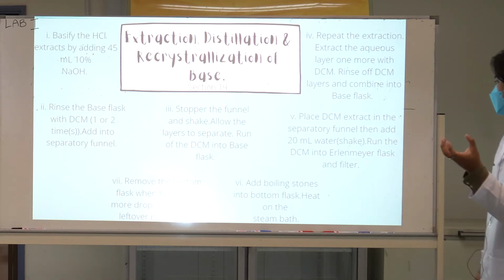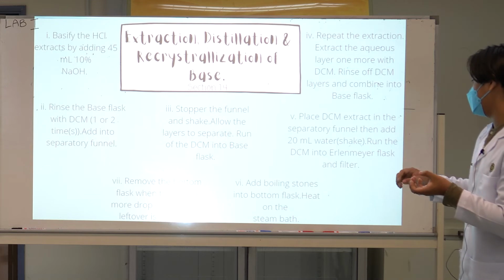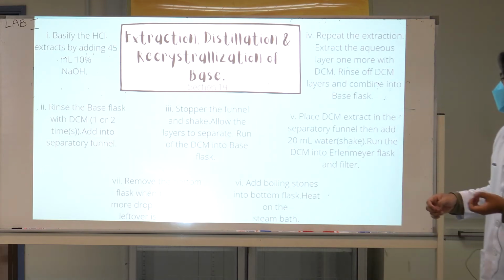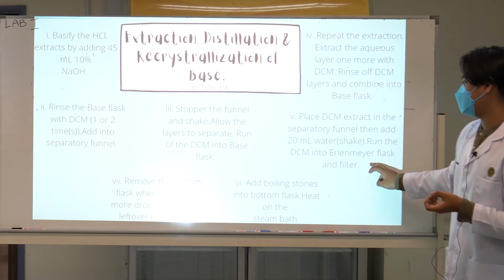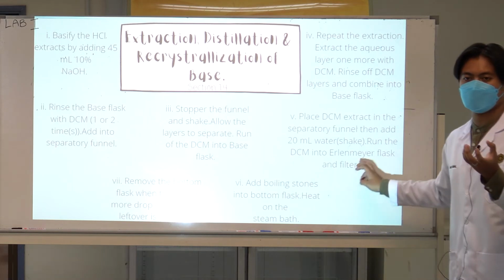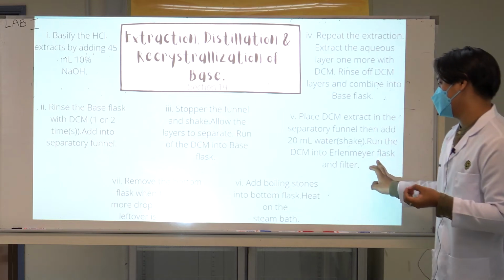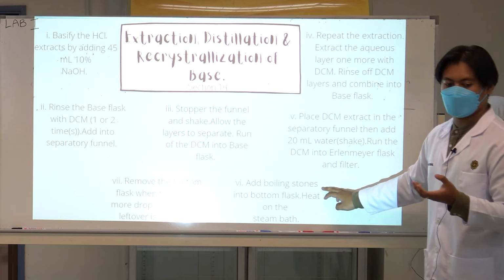Place the DCM extract in the separatory funnel, then add 20 milliliter water. So here we will use this in a distillation process. Then we need to add what?